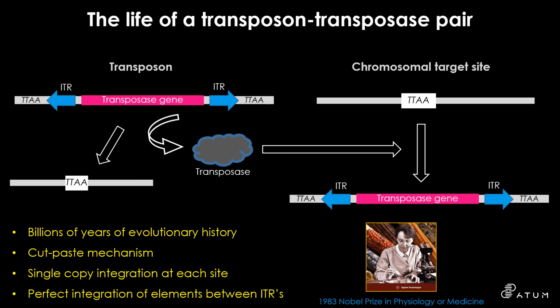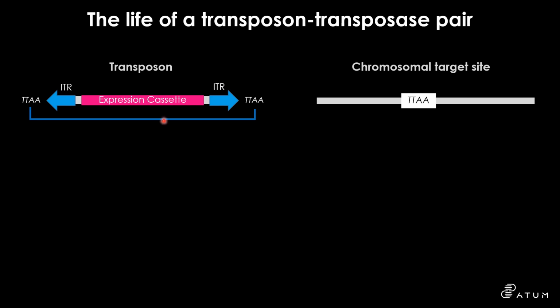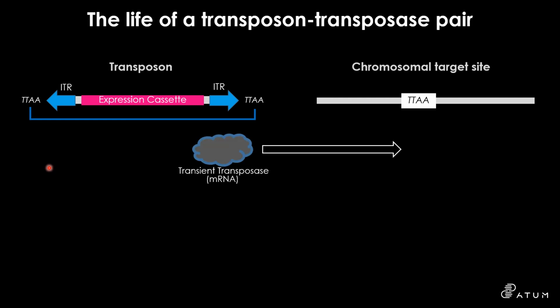So how do we apply this to biotechnology and creating CHO cell lines? I think it's quite evident to most of those listening to this. The transposon is, of course, integrated into an expression vector, wherein the gene of interest and all the regulatory elements are contained within the transposon on a circular DNA plasmid. You'll notice the absence of a transposase enzyme. This is provided in trans as a transient co-transfection of the mRNA along with the DNA plasmid.